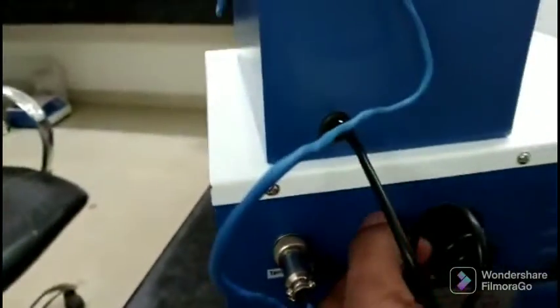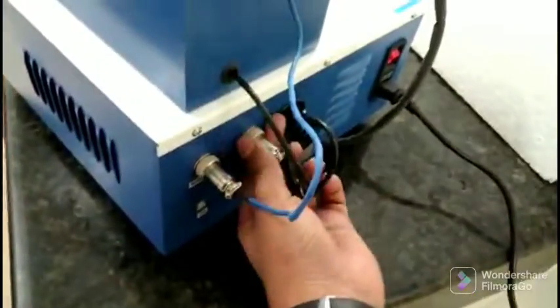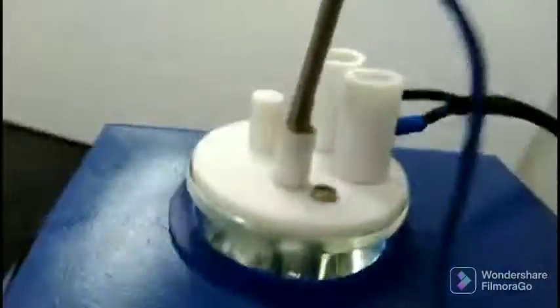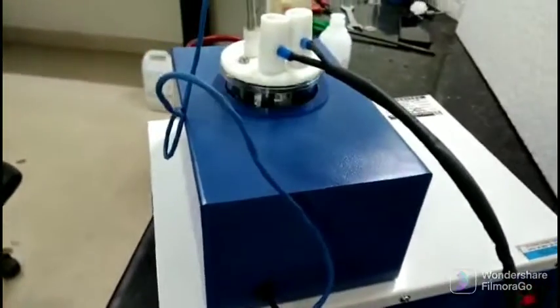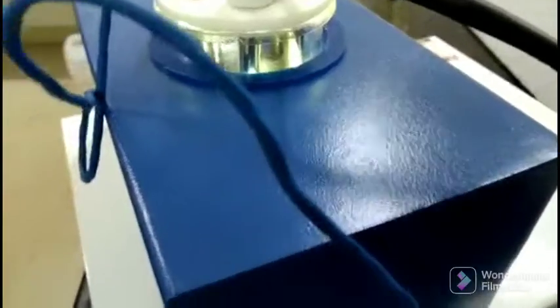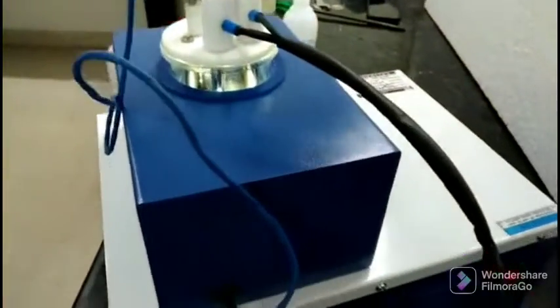This one is a light indication of your sample. When we connect this plug like that, your light is going to glow. When we remove it from this slot, it is going to turn off. You see that there is no light in your sample compartment. When you connect it, the light is going to glow.